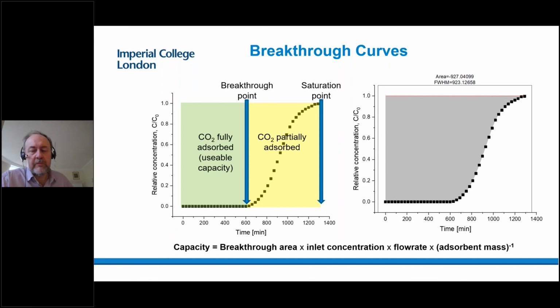One of the reasons we're able to manage them fairly well is that we have a lot of experience doing inverse gas chromatography, where dead volumes are also an important measurement. So we're certainly familiar with it. We can measure it. We didn't talk about it today, but in the future I will do a presentation just on breakthrough, and I'll explain in detail how we measure those dead volumes. But they are important to measure, and it will affect the accuracy of the results.